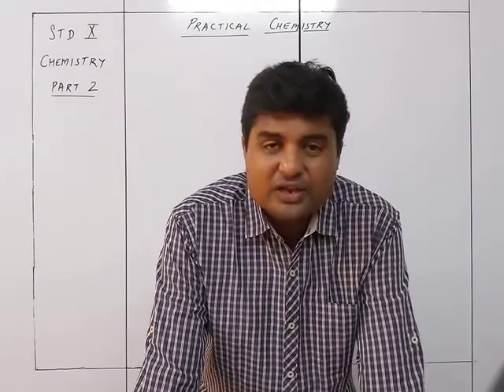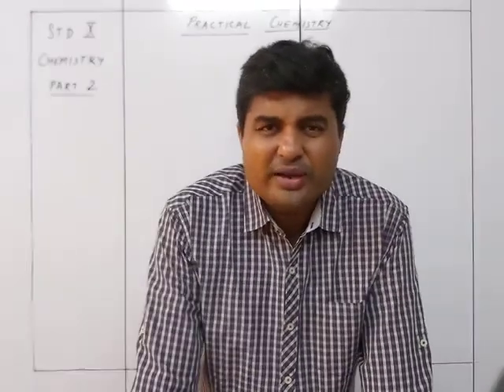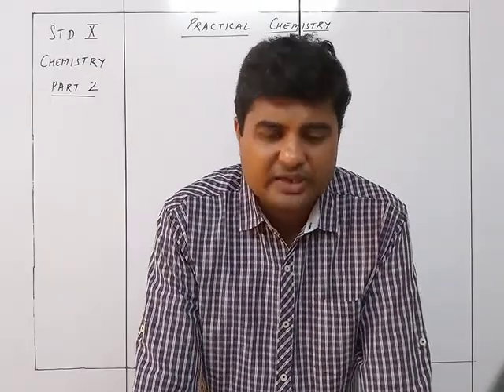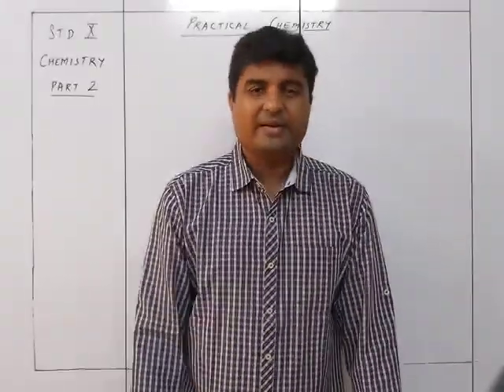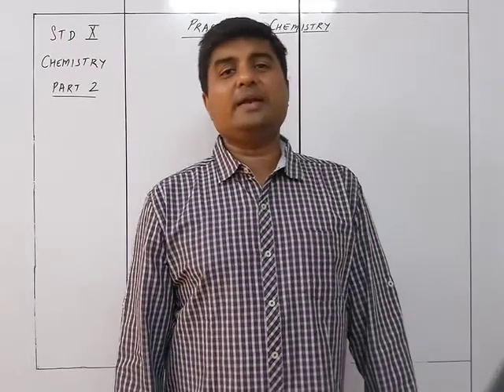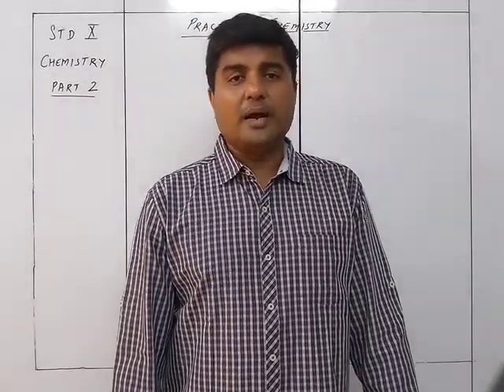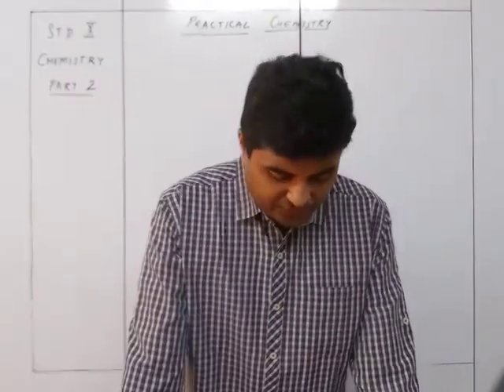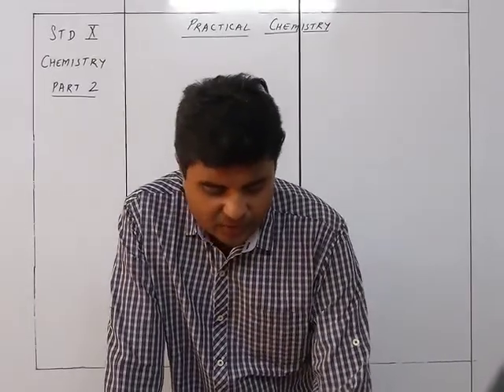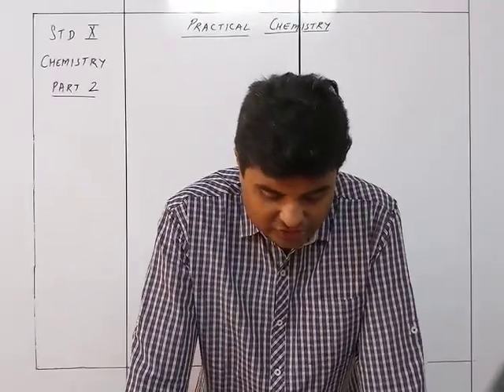And on heating with NH4OH, no change is seen because, of course, an ammonium salt is not going to react with ammonium hydroxide. So that's why there won't be any change taking place when an ammonium salt is reacted with ammonium hydroxide. But with sodium hydroxide, yes, it is going to give you the gas, which is nothing but ammonia. So you can see NH4Cl, when heated with NaOH, will give you NaCl plus H2O plus NH3 as the reaction.